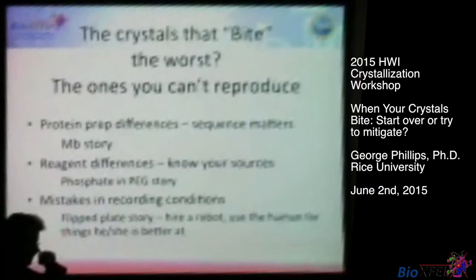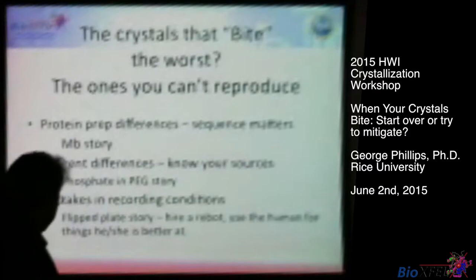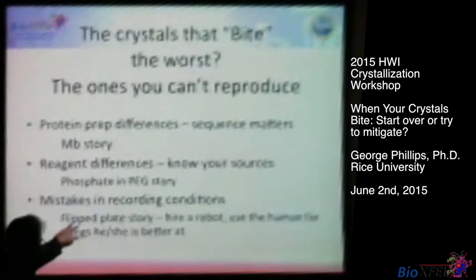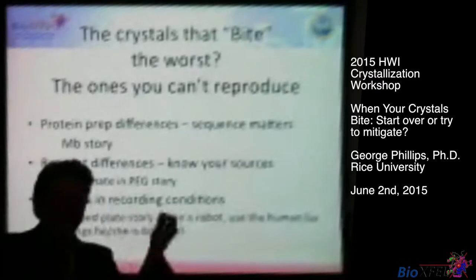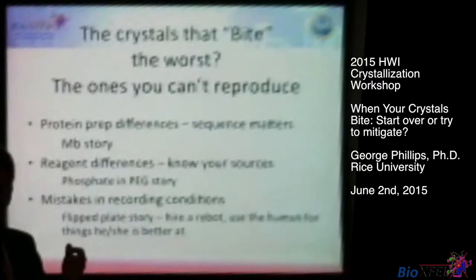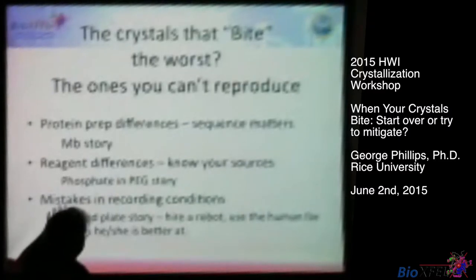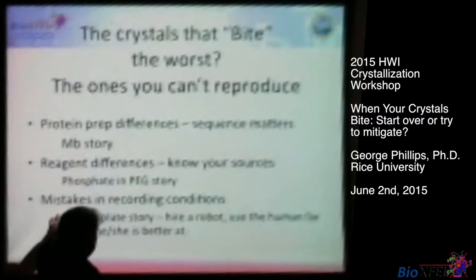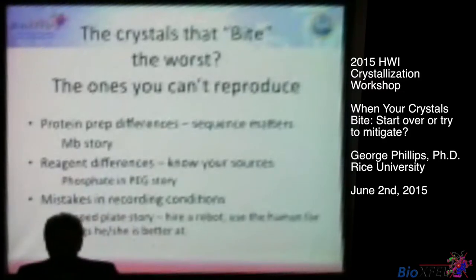Another lesson I've learned is that you can make mistakes in recording conditions. You know, we're human. That means we're good at thinking, maybe not so good at executing all the time. We had cases in my high throughput days when plates were turned 180 degrees and it's not reproducible because it's not the condition that you thought it was. The best way to ensure reproducibility and not wind up in this case of not being able to get crystals is to do a very careful recording and maybe even hire a robot.